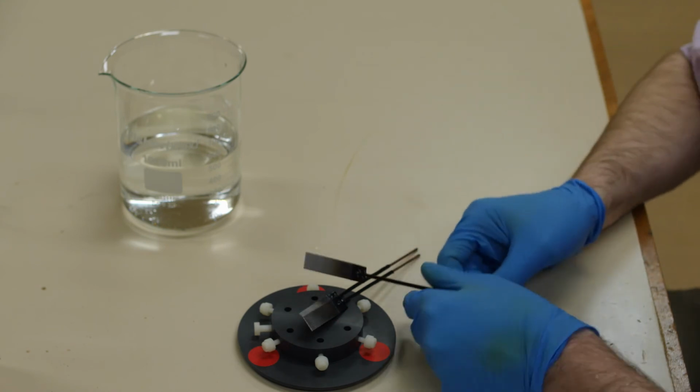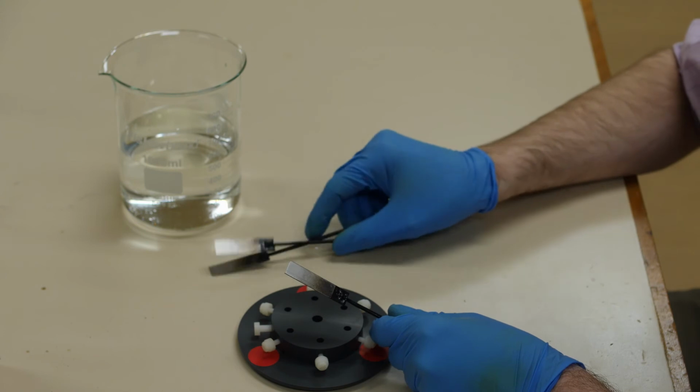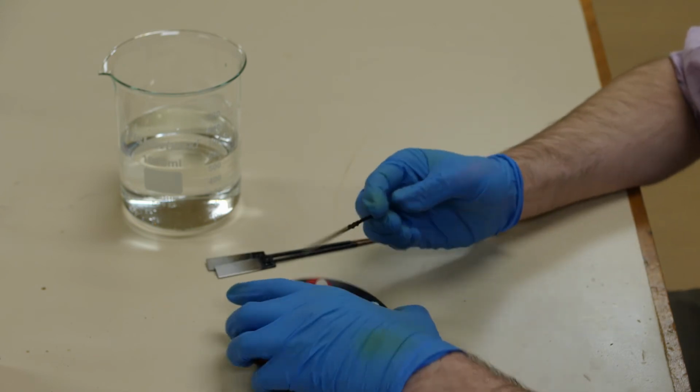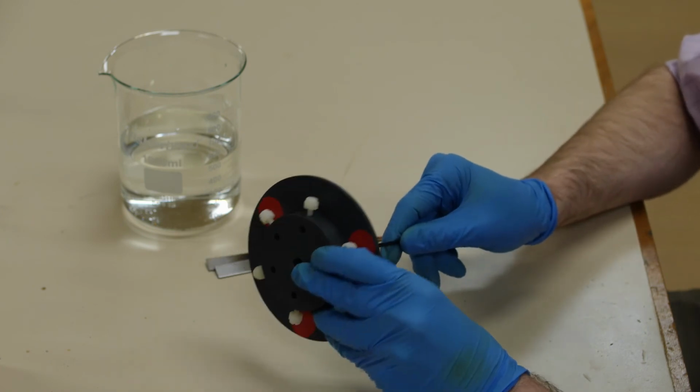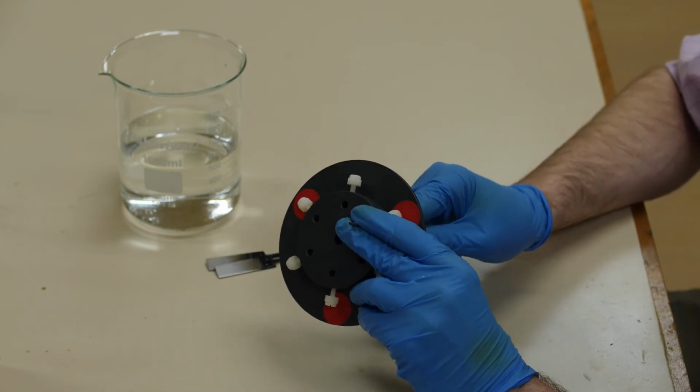The corrosion cell we are making consists of steel-zinc galvanic couples. First, the mild steel coupons are inserted into the lid of the cell in the marked positions.